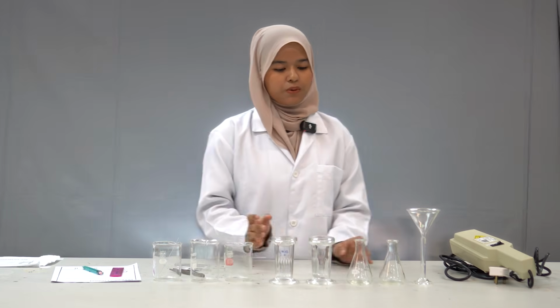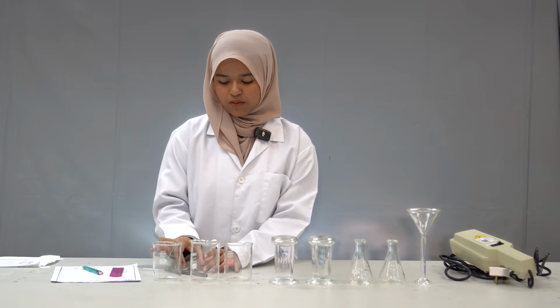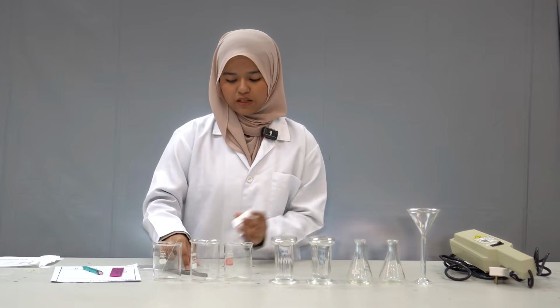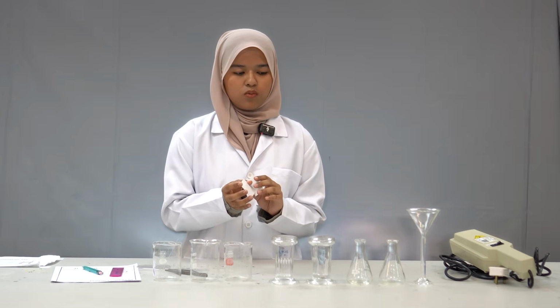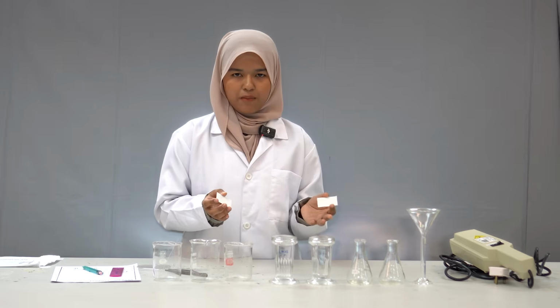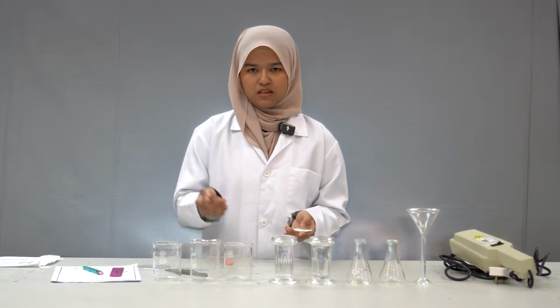Next, we will prepare our TLC plates. These two TLC plates will be used for two different solvents: DCM and hexane, and ethanol and hexane.